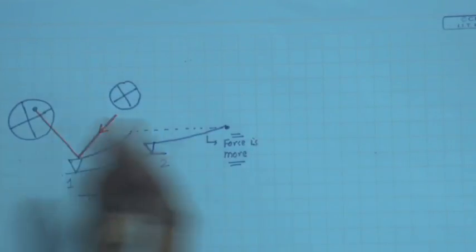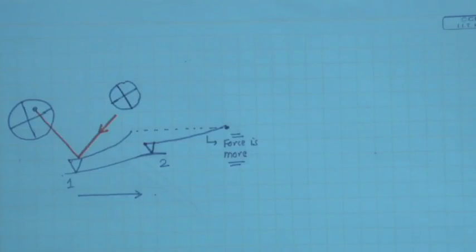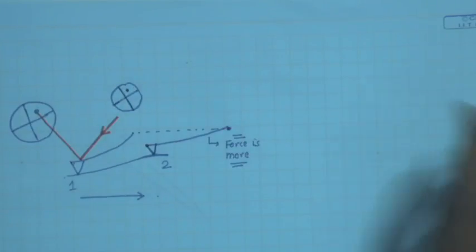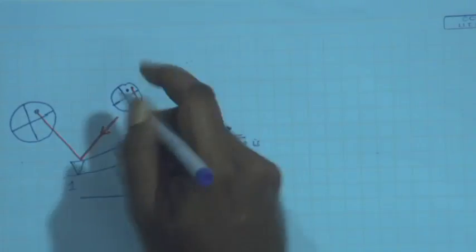Again, the sample can move or the tip can move, but if the tip moves, please remember it moves with its entire baggage. That is a laser source and the QPD. So, since the deflection has changed, now the reflected light is not falling at the set point, it is falling somewhere else. I will exaggerate this.